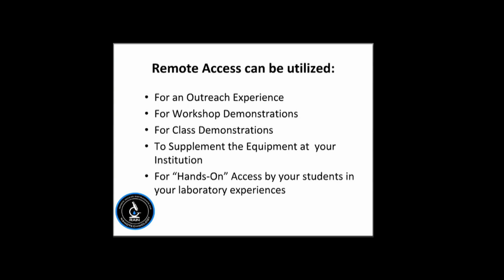You may have equipment at your school right now. You may be blessed with some really great equipment, and I know some schools are, but you might have an atomic force microscope, and you might want to compare it with a scanning electron microscope at one of your partners or one of your institutions in your area or anywhere across the nation. You could do that to supplement your own equipment. Or you might want to assign your students to do some work. We typically do that at the community technical college level, to actually do a lab and then report back the results. So there's a whole range of activities that you can do utilizing remote access.